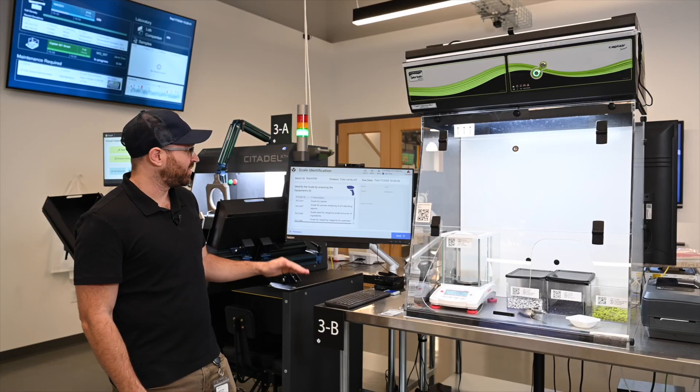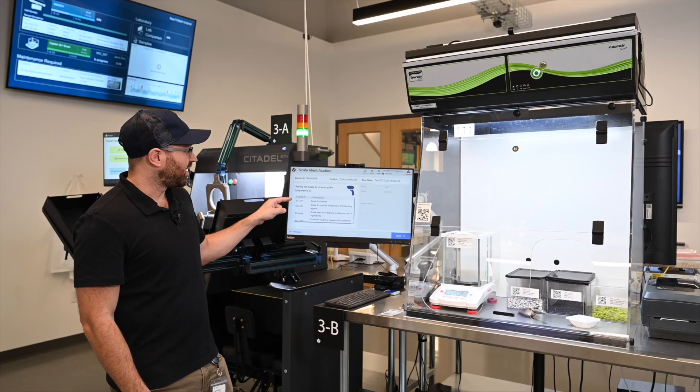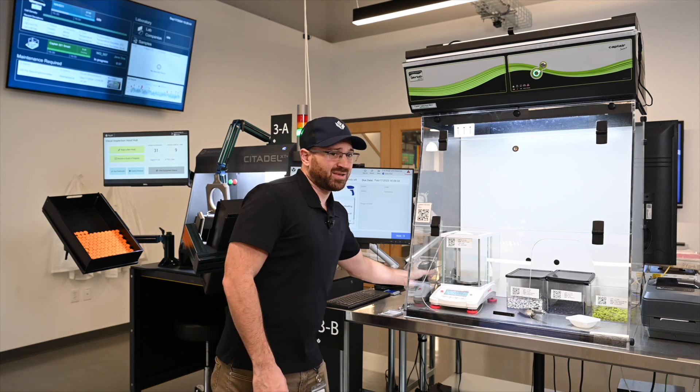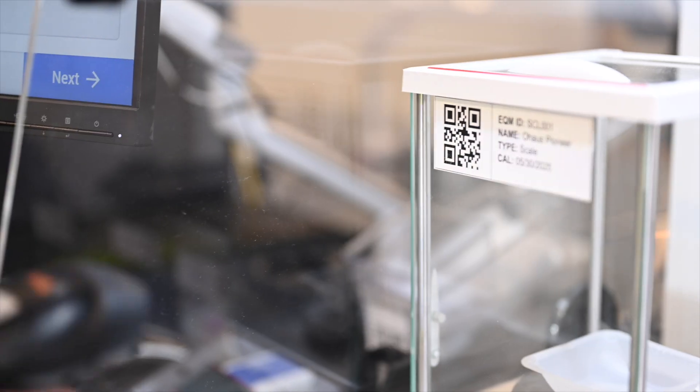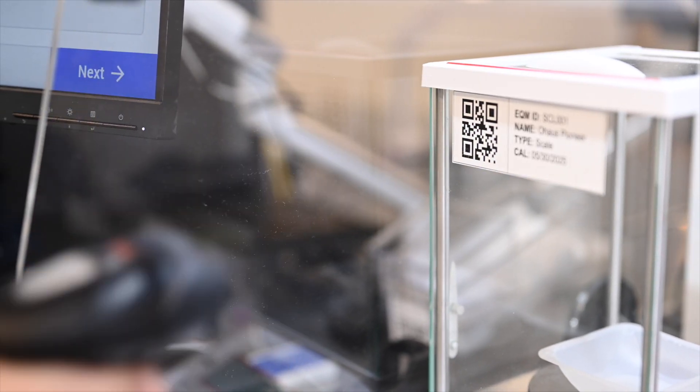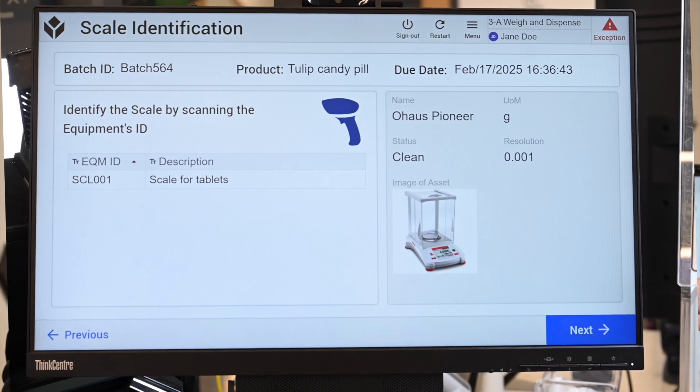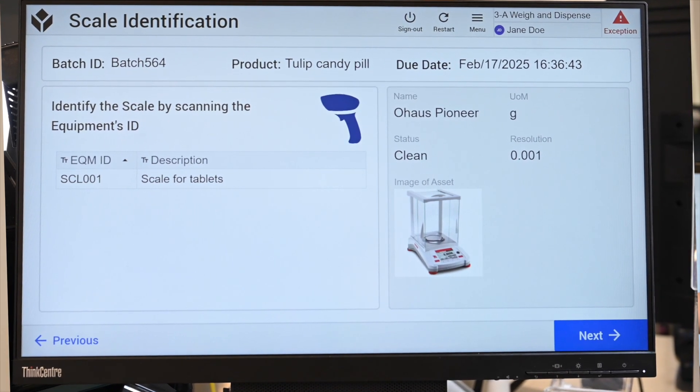Here I have to scan the scale. I could be using a number of different pieces of equipment. In this case, I'm going to scan the scale I'm using, because equipment can be managed the same way that we manage any other process. I can only proceed because it's in a clean status, but if I scanned a piece of equipment that was in use or required maintenance, it wouldn't let me proceed.